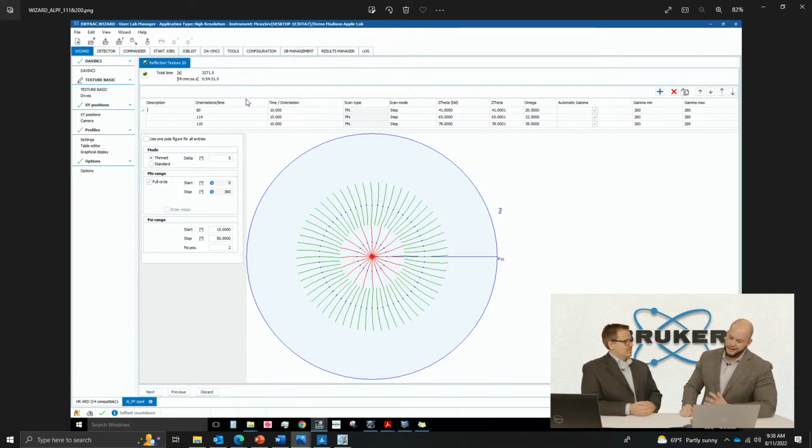So you can kind of gauge based on that, and then once you find the peaks you're interested in, for a pole figure, you just throw that right into the software. You can see I've set my 2 theta HKLs where I'm expecting these types of reflections, right? And then, kind of cleverly, in the middle of those two other ones, so I can capture both peaks with one snapshot, which is nice. So a little thoughtfulness there can save you a lot of time, and definitely I like that idea.